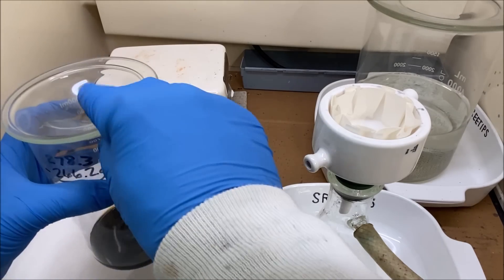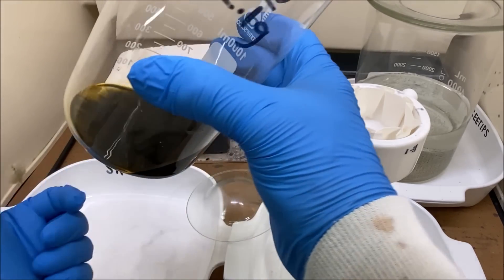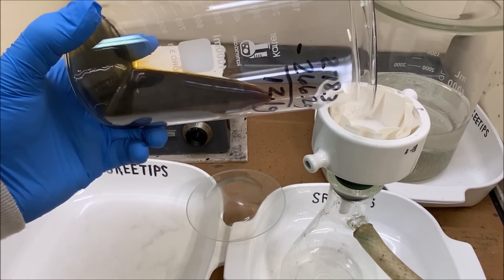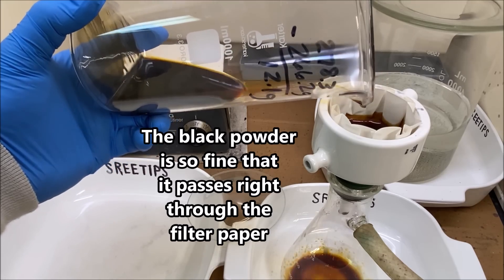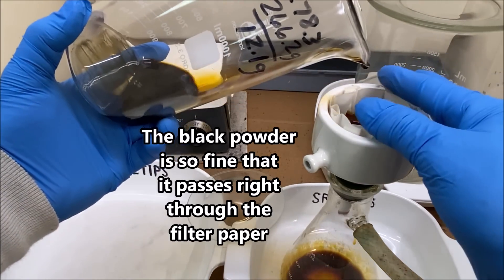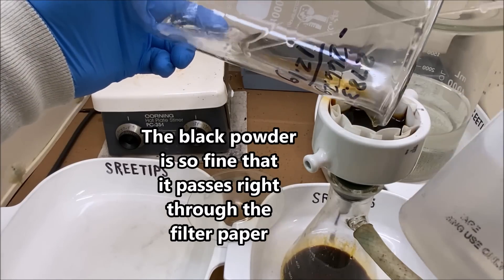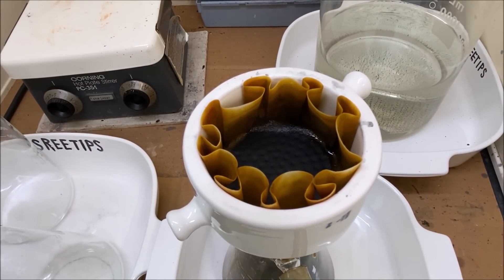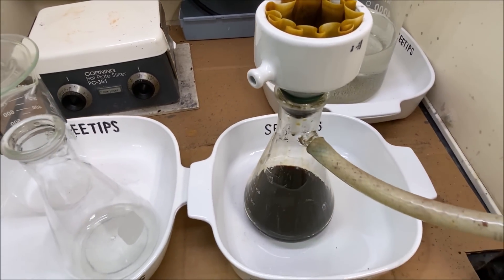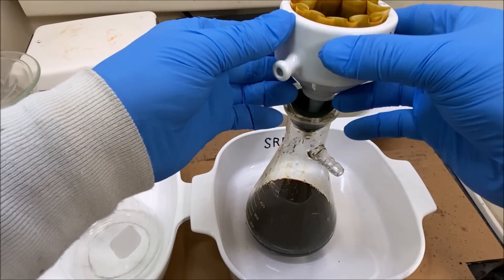I've allowed this to cool completely and removed the stir bar. There's definitely some black powder down on the bottom, so let's go ahead and try to filter this out. I've got all the liquid pulled through; I think what we'll do is pour the liquid back through the same filter a second time.